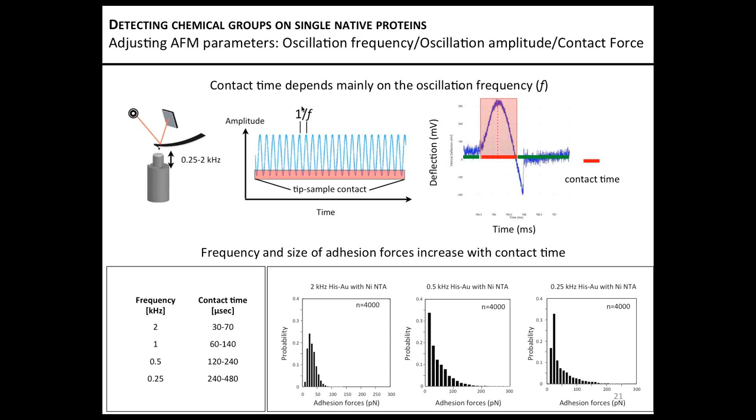But as you also mentioned during your talk, with higher frequencies there are fewer adhesion forces or unspecific interactions that you recognize. Is it true? That's true, because generally contact time is diminished. The question is whether there's still enough time to build up a specific ligand-receptor interaction. So we can't fool the timescales of biology by just scanning faster.